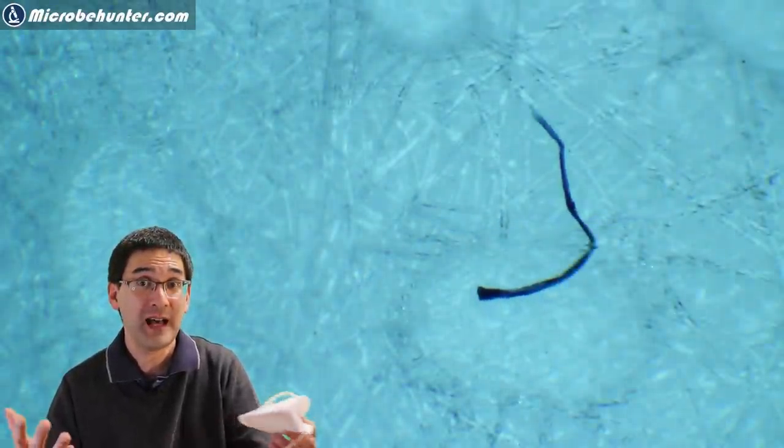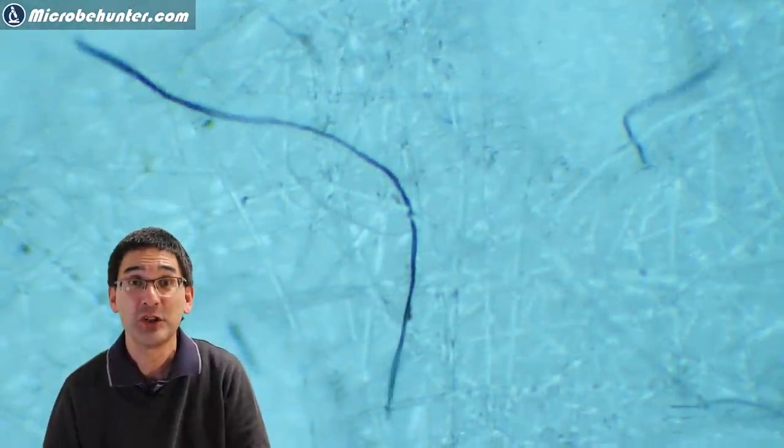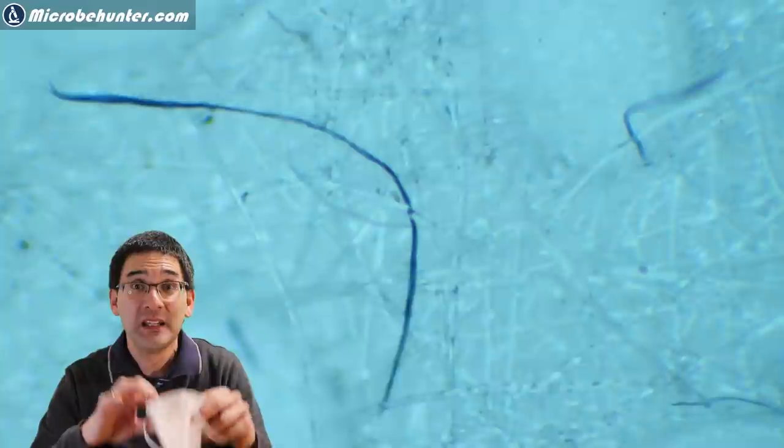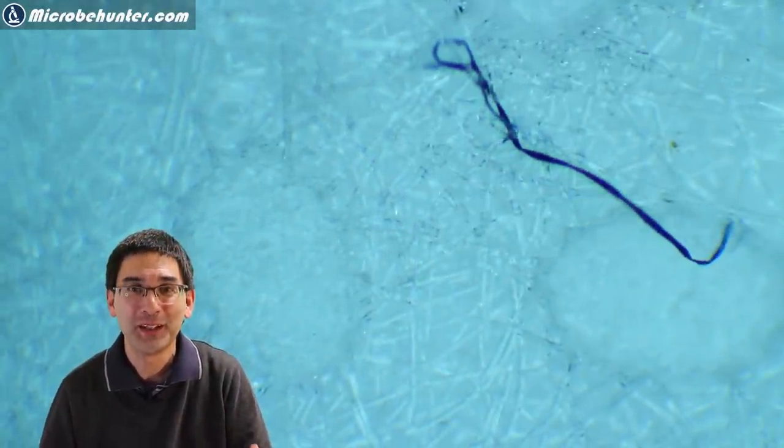I've actually received emails from people worried that these are actually worms living in their skin and now also in the face mask. Well I can reassure you nothing like that.